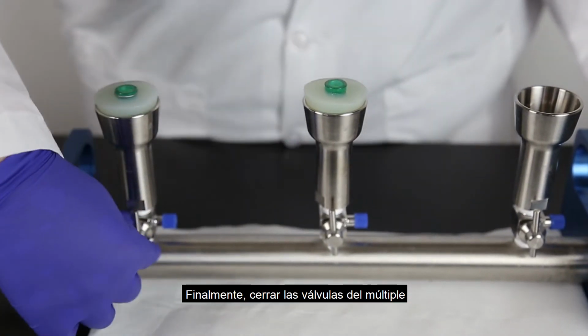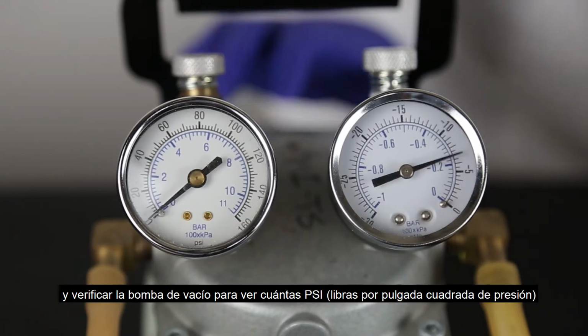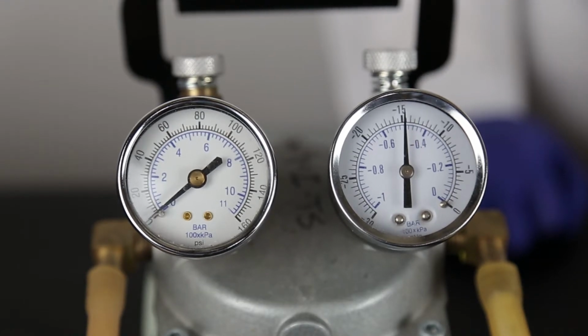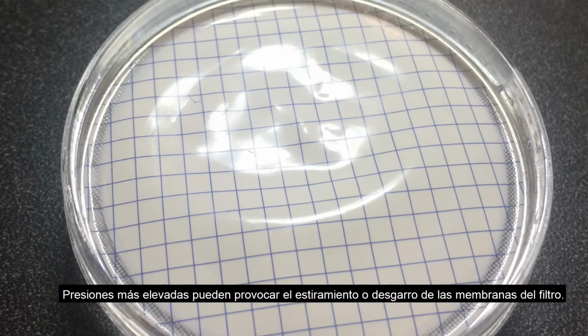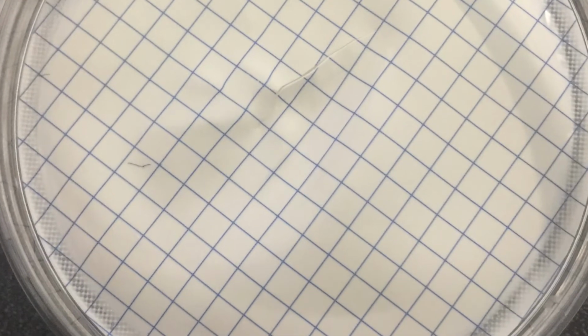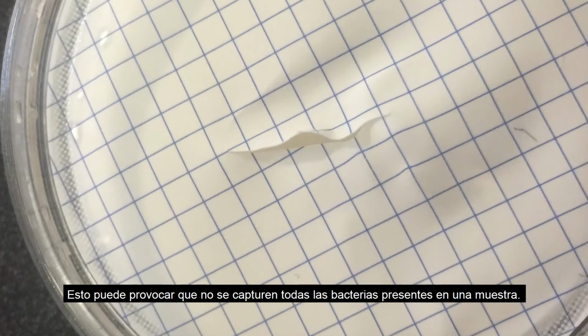Finally, close the manifold's valves and check the vacuum pump to see how many psi, pounds per square inch of pressure, it's pulling within the system. For testing with Neogen filters, it must be set no higher than 15 psi. Higher pressures can result in the stretching or tearing of filter membranes. This can result in not capturing all bacteria present in a sample.